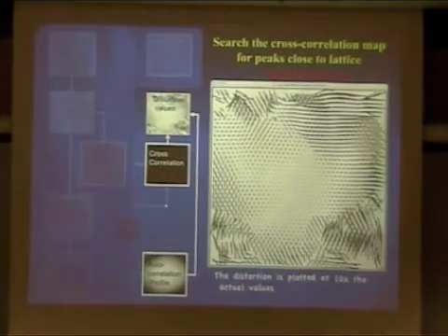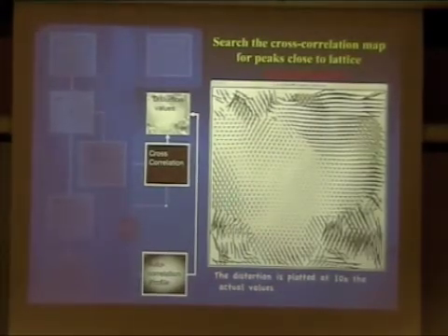Okay. So one thing I always want to point out is that this looks really scary, because some of the distortion looks as if it's out by the holes in the cell, but this is 10 times whatever it's actually distorted. It's not a very big difference.